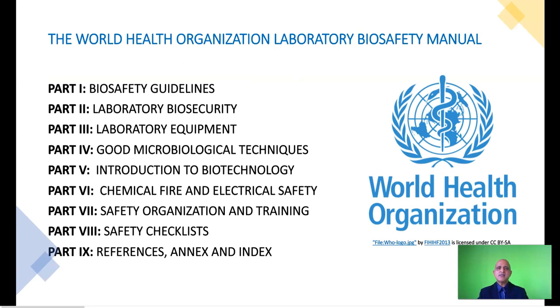To summarize, I will introduce you to the 9 parts of the WHO Laboratory Biosafety Manual. I am trying to do this in order to facilitate your understanding of the manual. It's a very exhaustive document which contains a large number of guidelines, and in this lecture I will highlight specific guidelines. However, you must study the manual in detail in order to obtain guidance for your respective facilities. So there are 9 basic parts to this manual, and part 1 begins with biosafety guidelines, and we will follow through each part in this lecture.